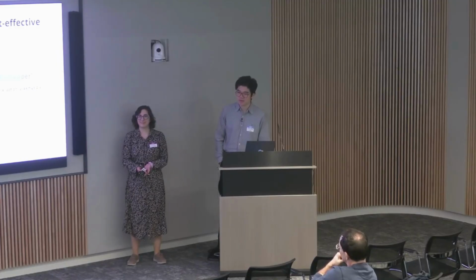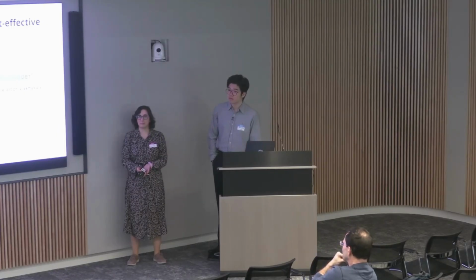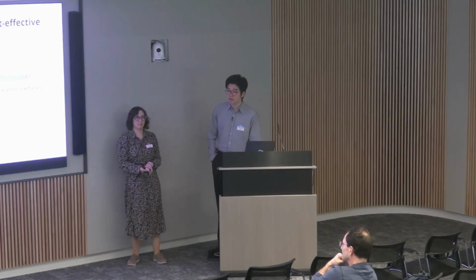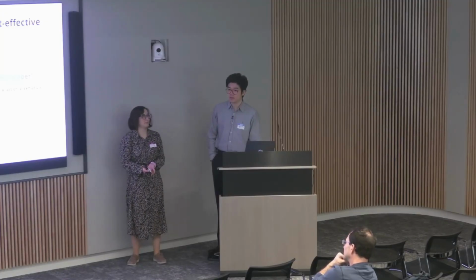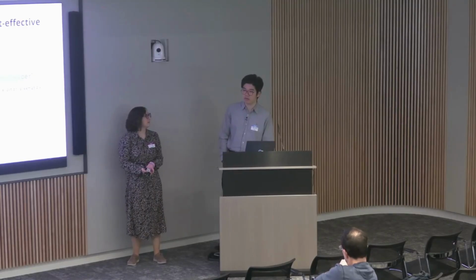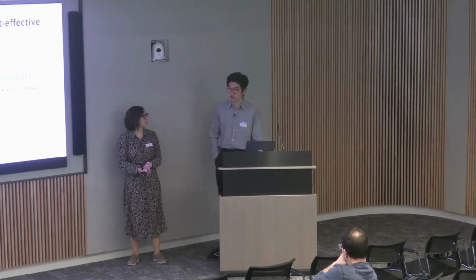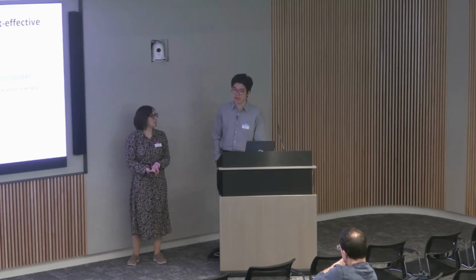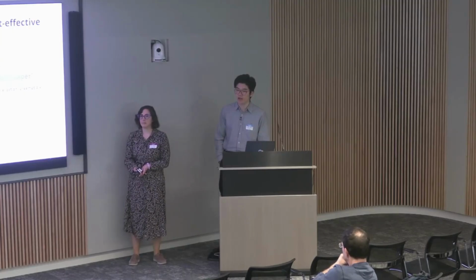Just one last question. Is all your work Windows-based? Because we're using Nextflow, which is Linux, and we see the performance is even faster. Do you have all Windows-based, or a Linux solution? These are all running on Linux systems. Okay. And for the next step, probably the next push on GitHub, we're planning to translate it into Nextflow, so it's compatible with more cloud platforms instead of being limited to Terra. Thank you.